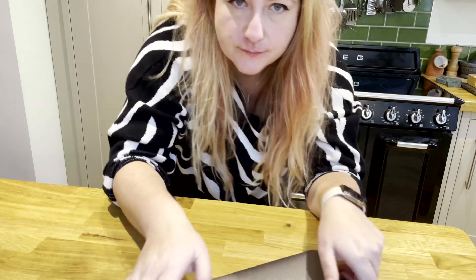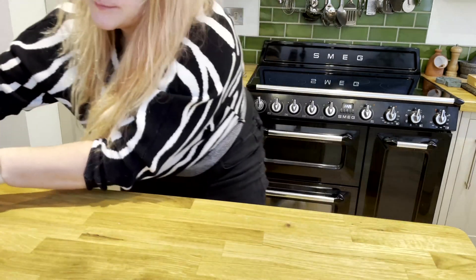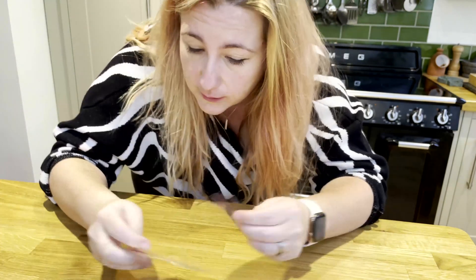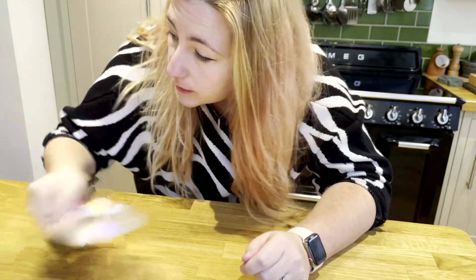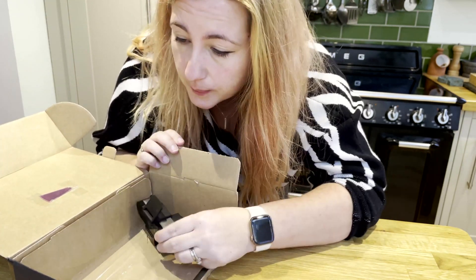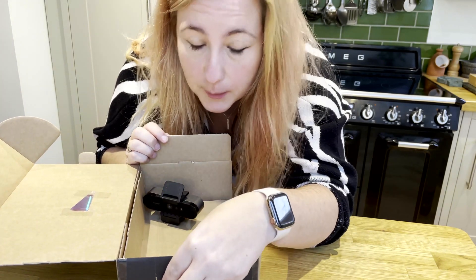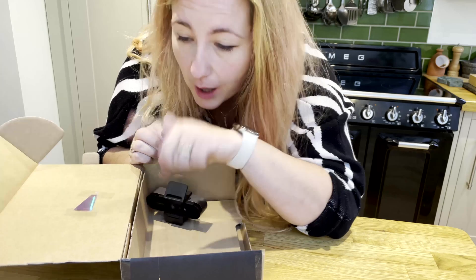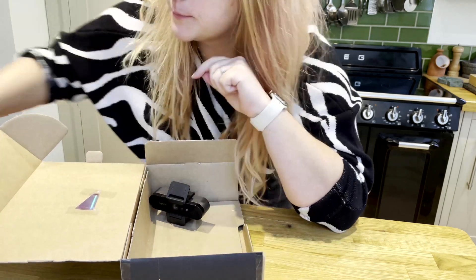To make a spectrometer, you will need a laptop, a shard of a DVD — which unsurprisingly comes from a DVD, I'll show you how to get that in a bit — a cardboard box, a webcam, a bit of card with a slit in it, and a light source.